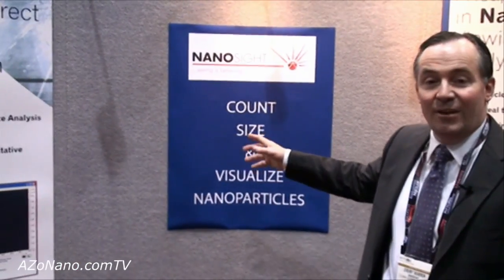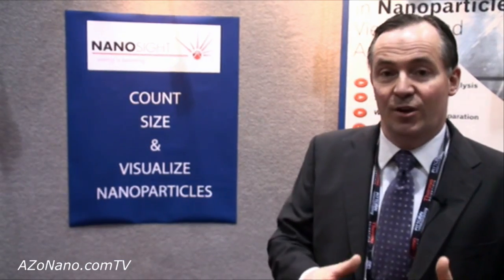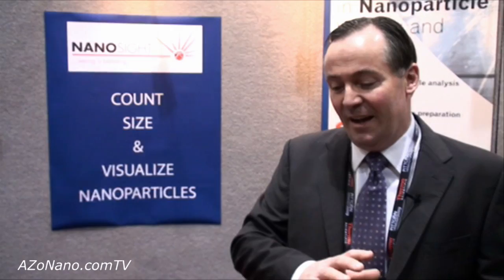And the third area that's most active for us at the moment is counting. Counting for us means the ability to count the number of particles in the view that we've described here, and that's relevant for the producers of vaccines. Those producers of viruses essentially use plaque assay techniques at the moment to attempt to measure the concentrations of the materials they're producing. And what we're able to do very quickly is produce a count, a concentration of virus vaccine particles, and also to pick up protein aggregation in their stored samples far earlier than anything else that they've seen so far. So, exciting time for us.